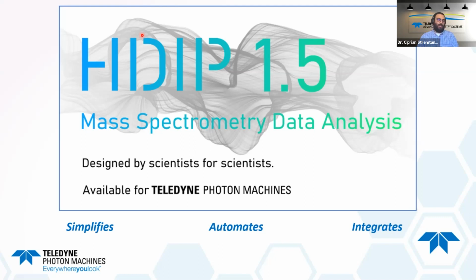The software was initially developed by the group at Ghent University, in Frank Vanhaecke's group, but then was carried over to Teledyne and developed even further. It's now a true mass spectrometry toolbox for data analysis and so on. The idea behind the software is to enable even the most novice of users to make the most out of their laser ablation ICP-MS setup.